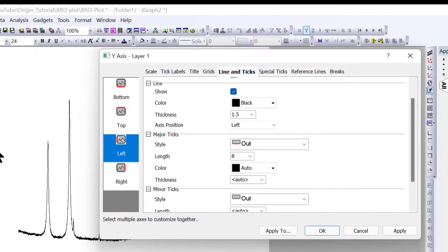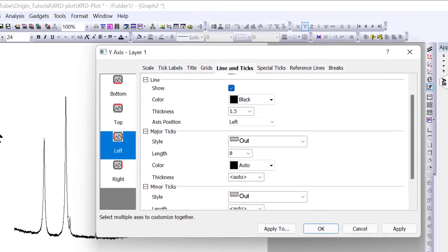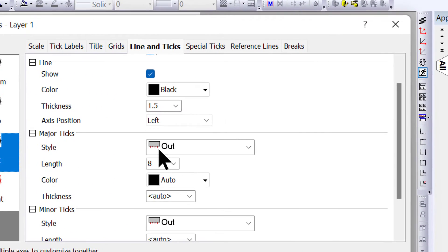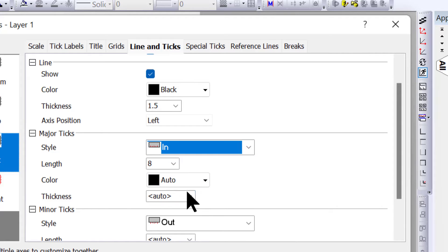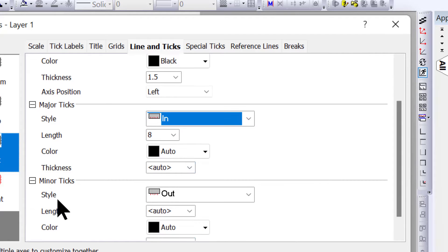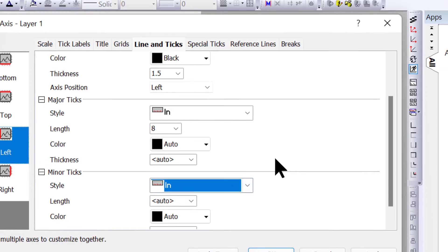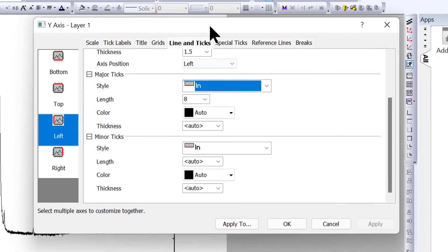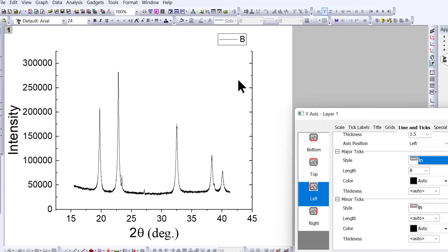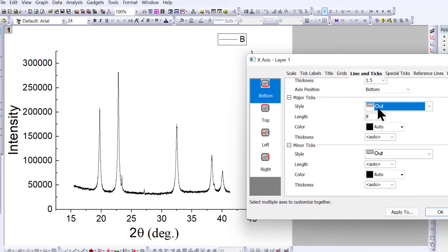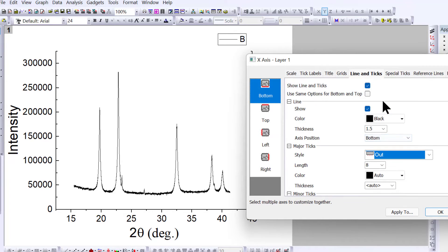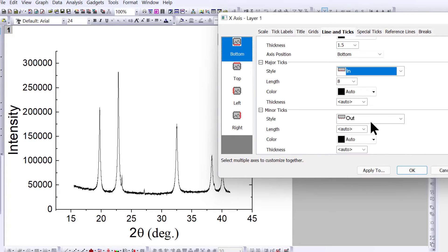For major and minor ticks, if you want them inward, click 'In' for both major and minor ticks, then apply. You'll see the axis appear. Similarly, for the bottom axis, click here and select 'In' again, then apply.